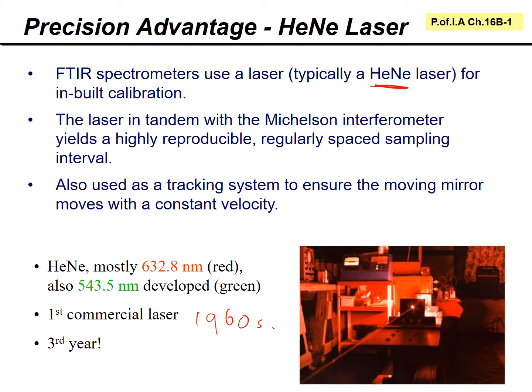So in combination with the Michelson interferometer, the built-in calibration laser ensures that the mirror moves perfectly in a nice steady way, and you get a high precision measurement.